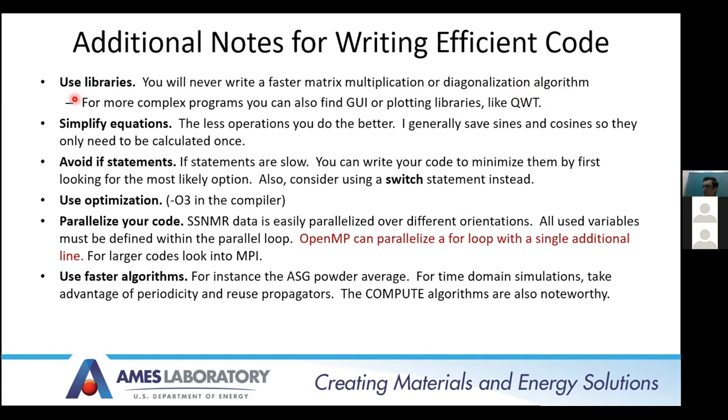And you can also look for other things that might be useful for writing programs. So for example, in this program that I wrote, QUEST, which is a graphical program for simulating quadrupolar line shapes in exact cases, I use a library called QWT, which takes care of all the plotting, so it's very easy to do.